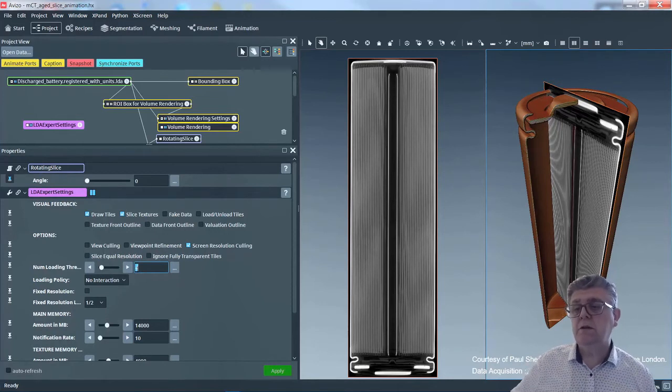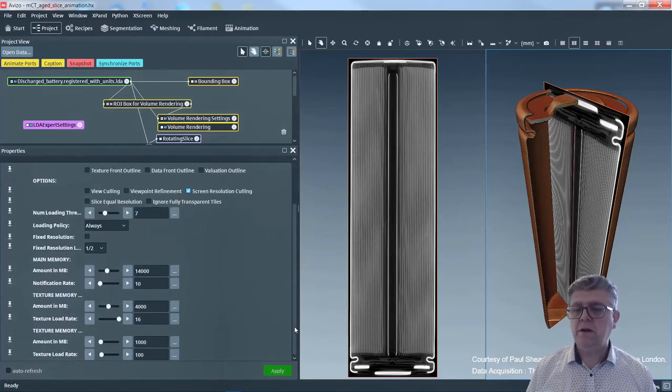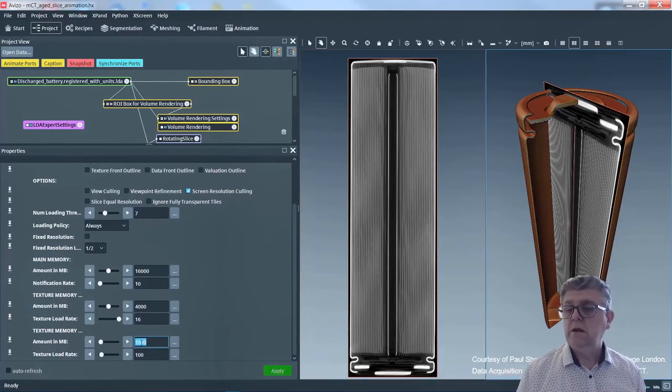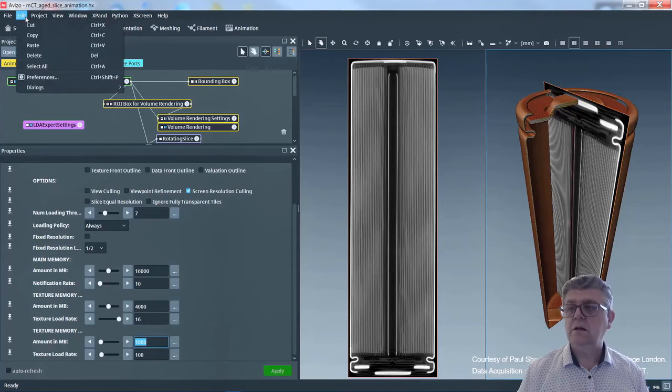I'm going to increase the number of threads that load data, and I'm going to force always loading. This is okay because it's a video. I also set my memory to be as much as I can, so I have 2 spare gigs. Let's load it. You see, my memory is now going to 94. You have to prefetch as much as you can. That's another important trick.